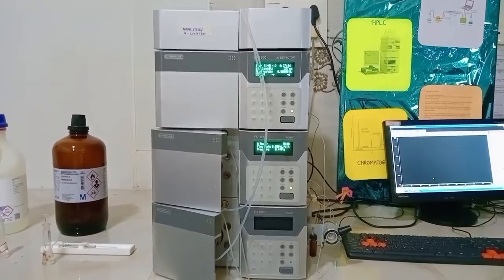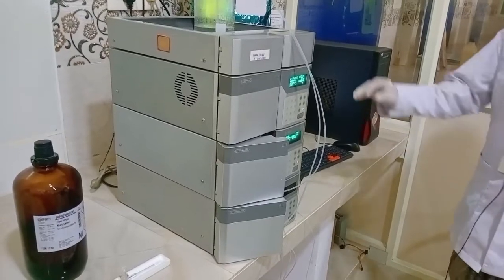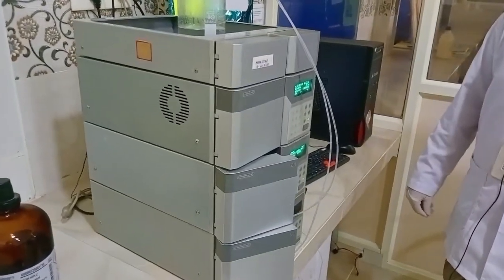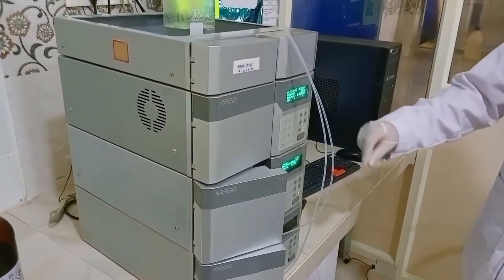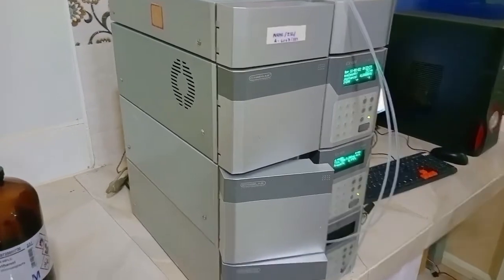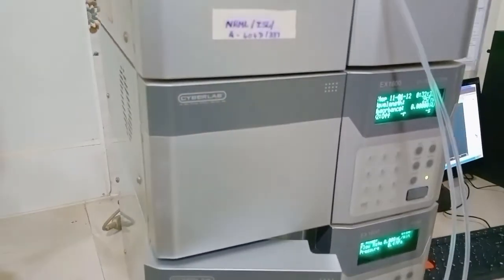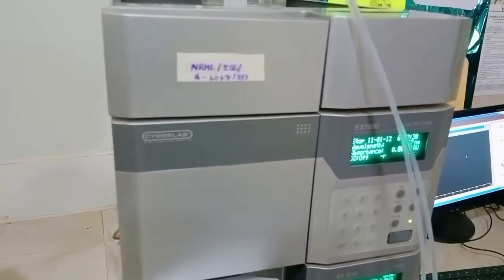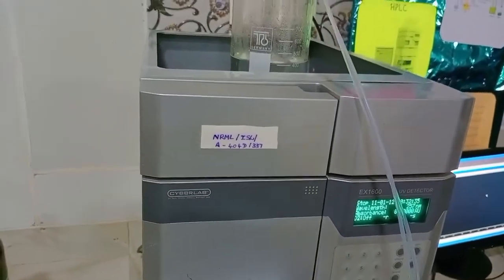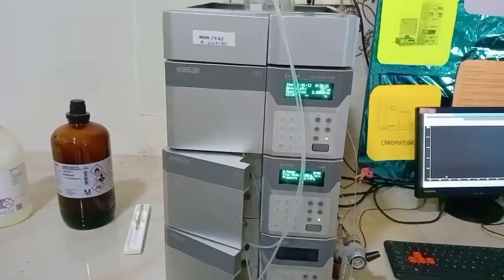Then you go for the analysis of the sample. Before analysis of the sample, you wash the columns and wash the pumps. Washing of the pumps is termed purging of the pumps, in order to remove previously analyzed particles that are present in the pumps. It should be purged, and the column will be saturated with the mobile phase that we are using in the sample analysis, which is called washing of the columns.